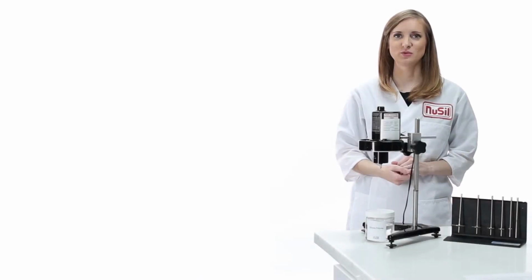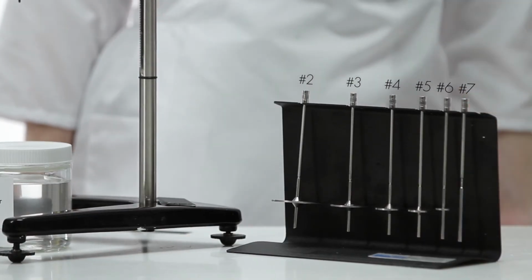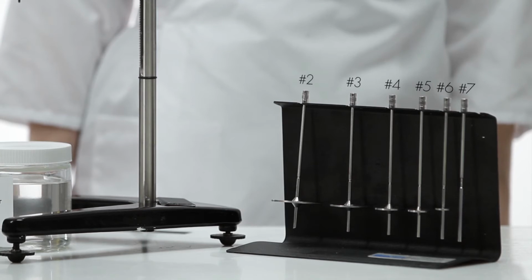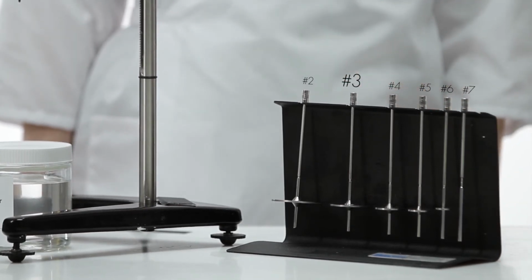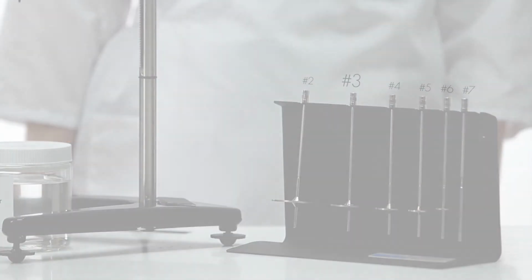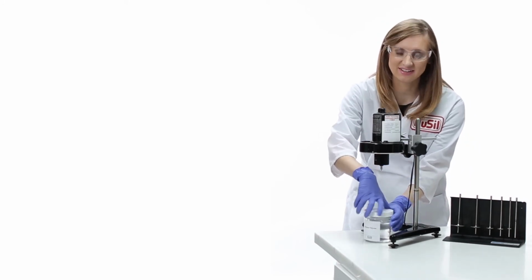Before we start testing, we need to choose the right spindle to introduce the rotational force. There are several types of spindles to use, depending on the viscosity of the material. Today, we're using spindle 3, which we've predetermined to be the most appropriate for this material. Be sure to use the proper safety precautions by wearing safety glasses and gloves when testing.